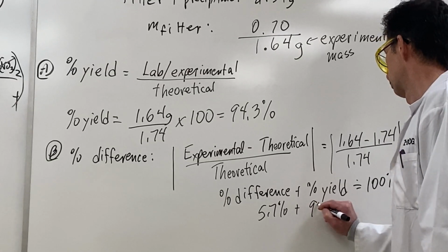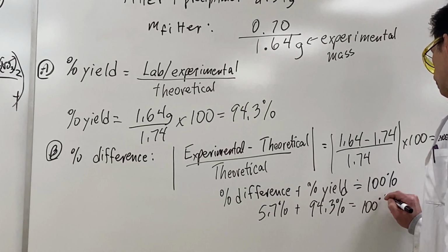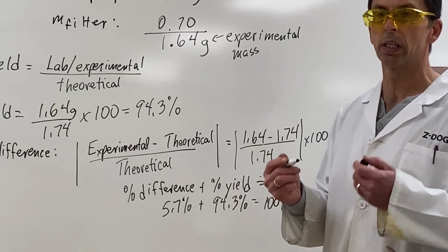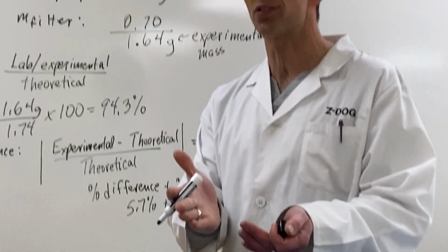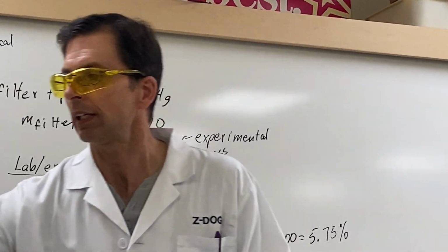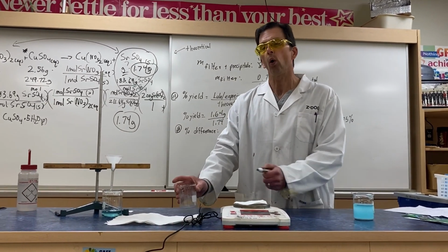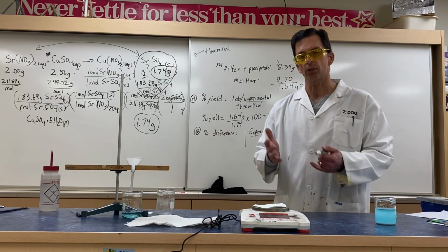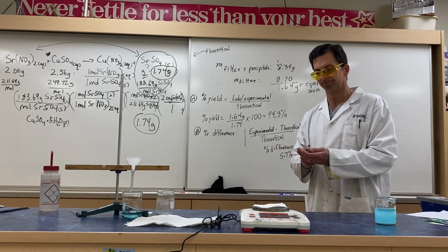There are many places in a little lab like this you could have catastrophic mistakes. And we mentioned some of them, of course. So losing your precipitate as it gets transferred to the scale, not fully rinsing out your reaction beaker, overflowing your funnel with your mixture. All of these are ways that can compromise and lower your results.